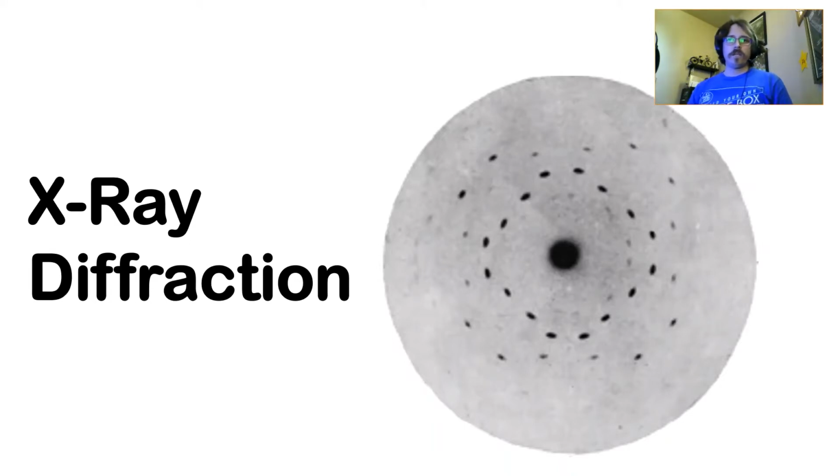Continuing our lectures on X-ray diffraction. What I have here is an early diffraction pattern. For the most part, with the exception of single crystal diffraction, diffractometers give you a spectra. So you have to figure things out from looking at a line on a screen.